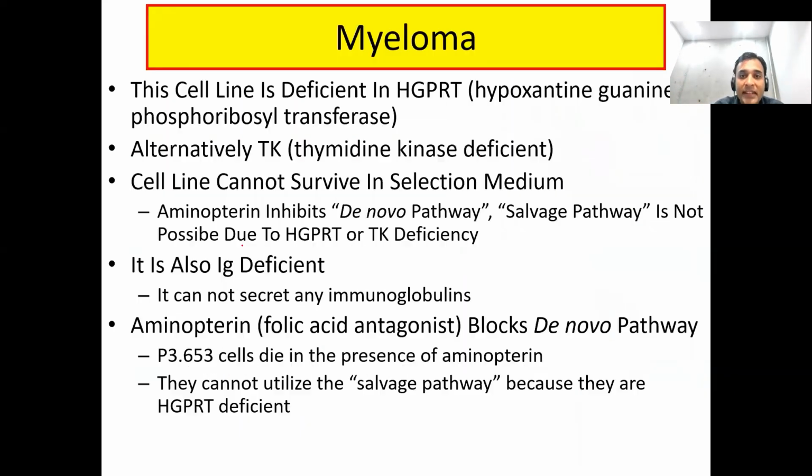Once you have selected them, finally, you make a culture. Now your work is to create a culture. You can make a monolayer culture or you can create a suspension culture, depending on the particular cell line. You remember that on ATCC you can buy these hybridoma cells directly, right? You can buy them, but they are a little expensive because they produce antibodies. So this is the whole story.